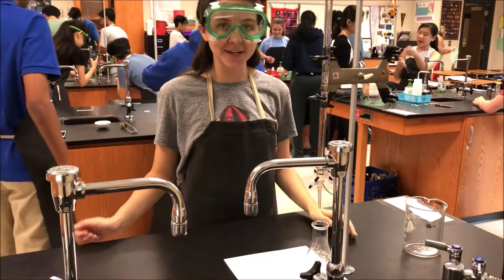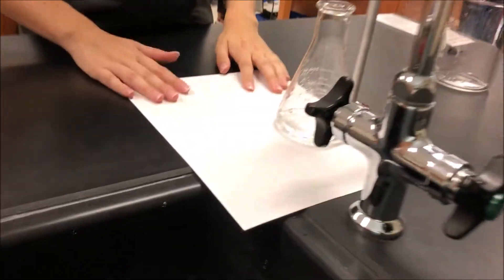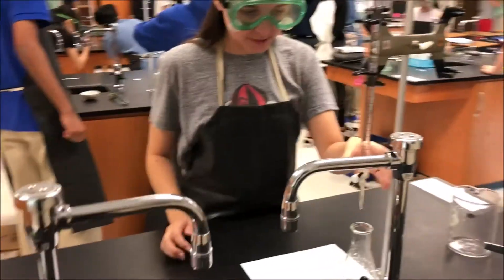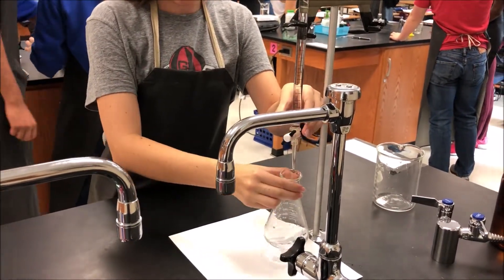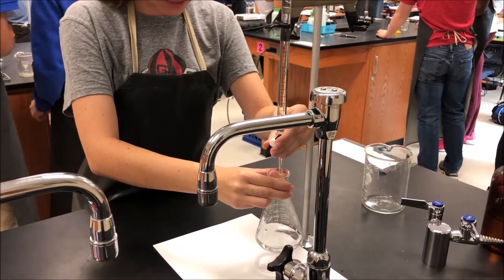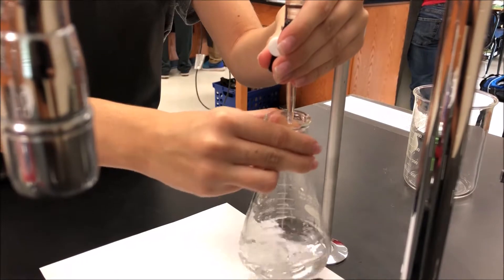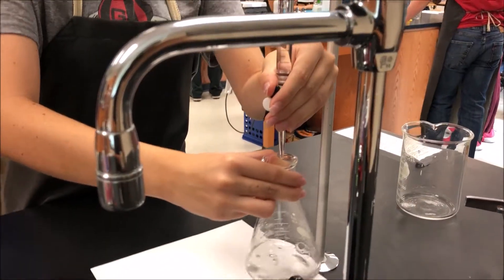Now we're going to do the titration. Make sure that you have a white piece of paper as a background so you can see the colors better. What you're going to do is take the stopcock with your left hand if you're right-handed, and your Erlenmeyer flask with your right hand, and slowly turn it on. And you're going to swirl with your right hand until it changes color.